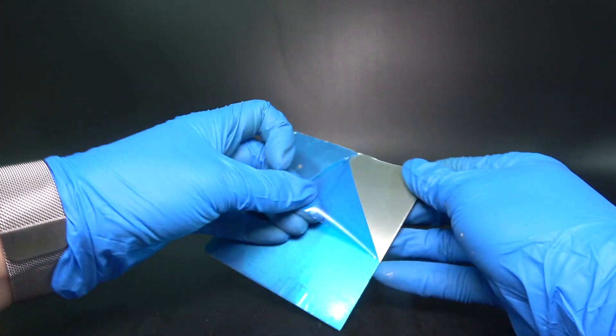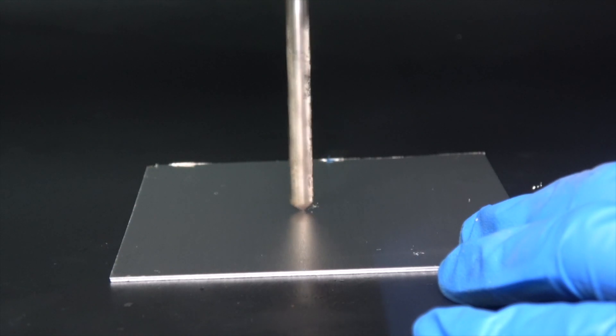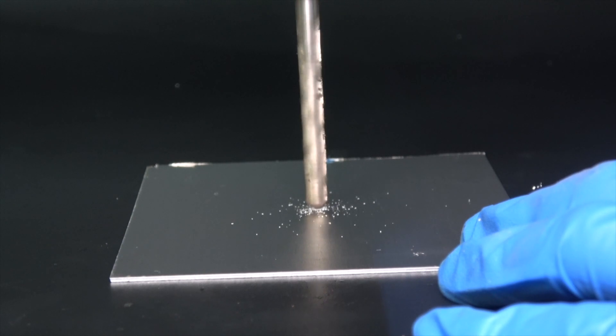Aluminum forms a compact layer of aluminum oxide on its surface, protecting itself from further oxidation. This oxide layer also prevents amalgamation from happening.